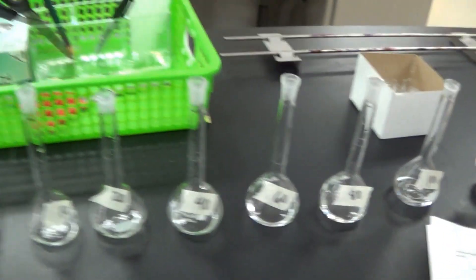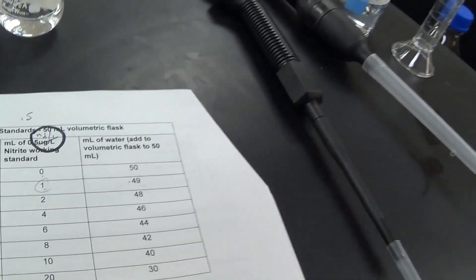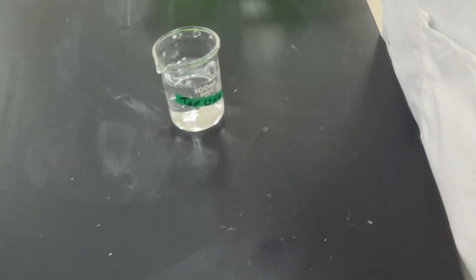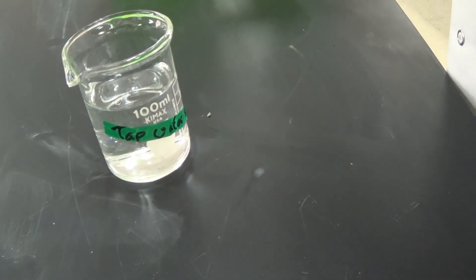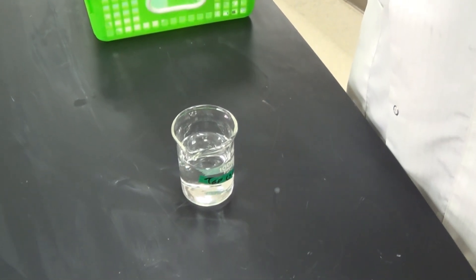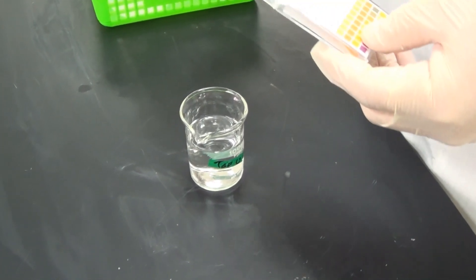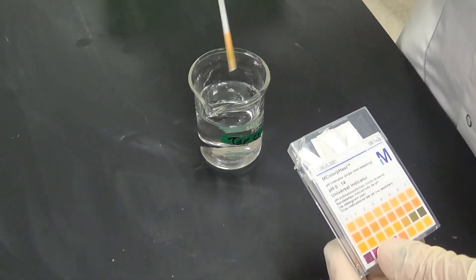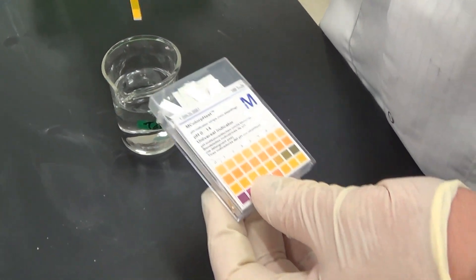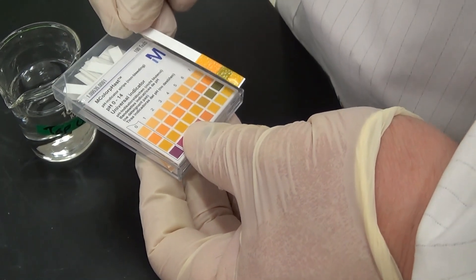Each of these we're going to fill up to 50 mLs with the DI water according to our directions. This is our test sample. Before we set it up, we need to test its pH and make sure it's between 5 and 9. It looks like it's about 6.